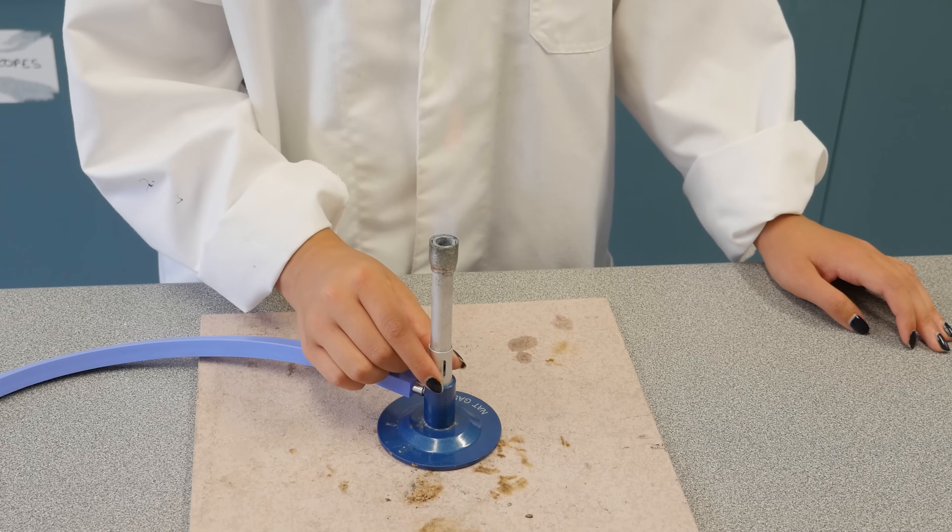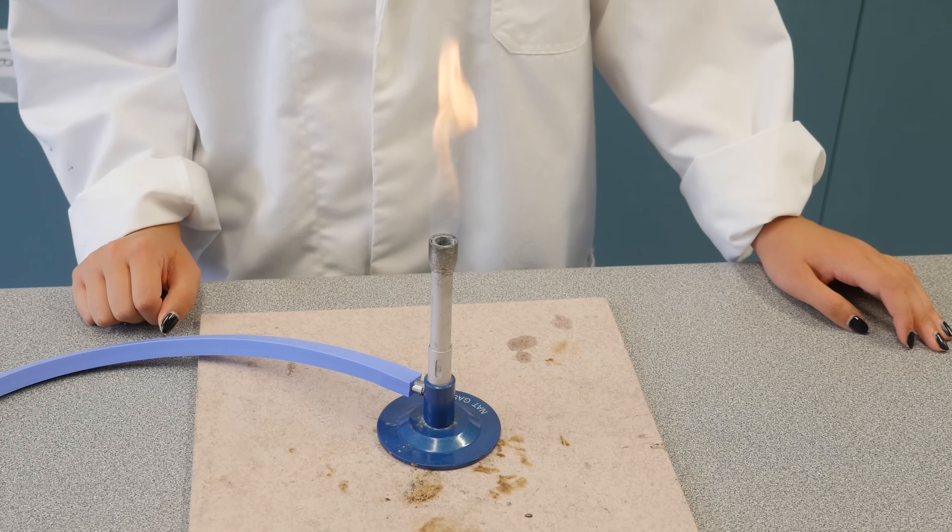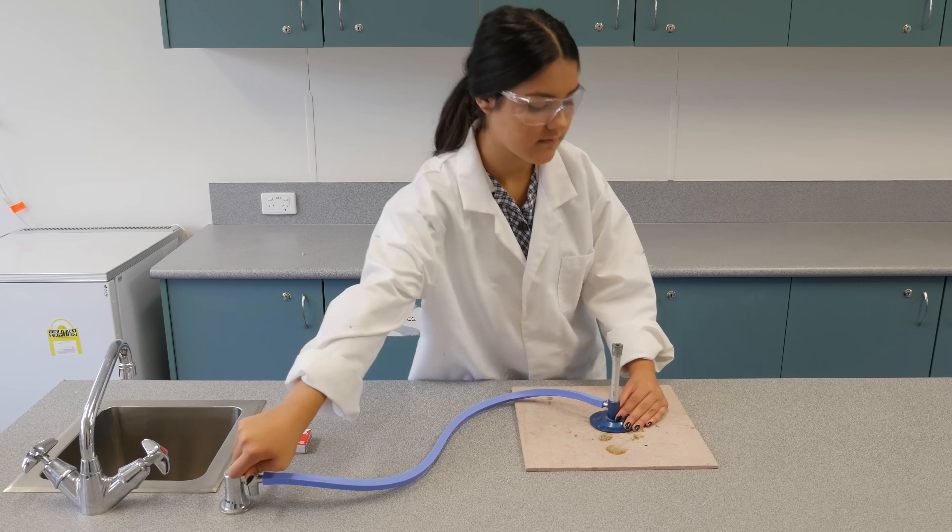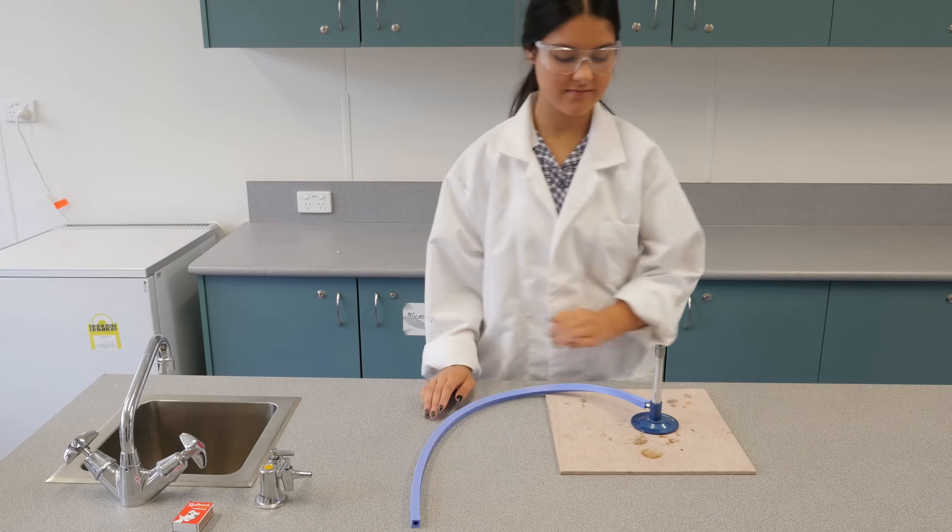Okay, so you've finished your experiment. Before turning off the Bunsen burner, close the air hole first to return to the safety flame. Now you can turn off the tap and blow out any small flame that remains. Disconnect the hose and leave the Bunsen burner to cool before packing it away.